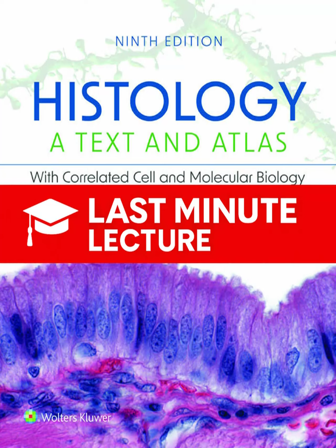And when we look at a micrograph, like the one of the kidney in figure 1.2, that magenta staining just pops. It really delineates the structures. It does. Figure 1.2 clearly shows those PAS-positive basement membranes stained bright magenta, forming these really clear boundaries. You can see them surrounding the kidney tubules, the glomerular capillaries, and the Bowman's capsule. And that's because those basement membranes are rich in proteoglycans and glycoproteins. All of which have the carbohydrate components that the PAS reaction targets.